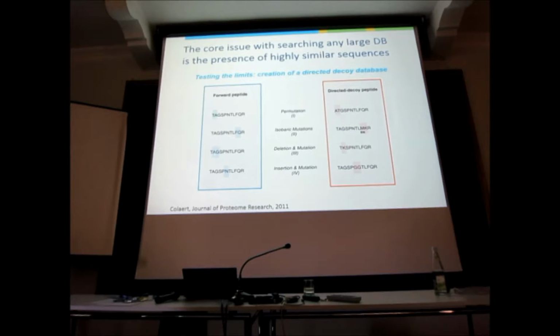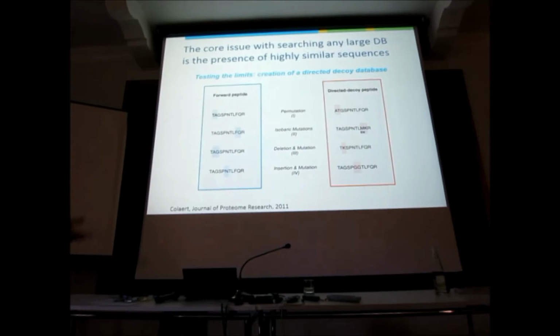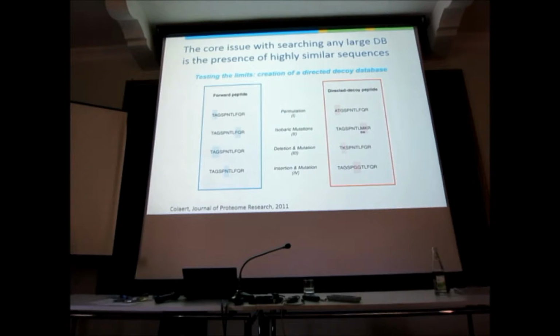Here we have deletion or mutation. Alanine and glycine together have roughly the same mass, at least for an ion trap, as a lysine. And then here we take asparagine and replace it with 2 glycines. So you see we make a lot of Photoshop peptides. This is always the same guy, but it yields very many Photoshop versions. So if this is our peptide, we make these Photoshop versions. Then we take another celebrity and we take all the other imitators. And so we go on so that every one of these 70,000 peptides has at least 100 imitators in the database. This is really pushing the search engine, right?